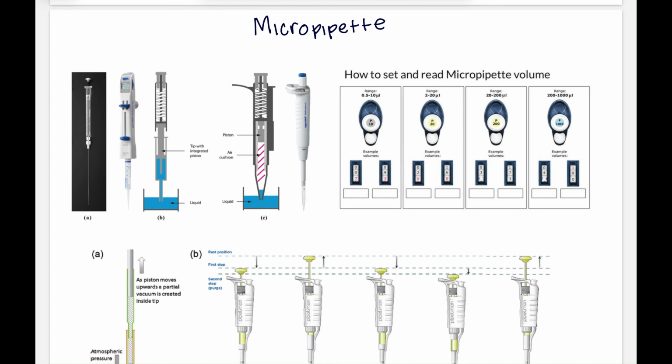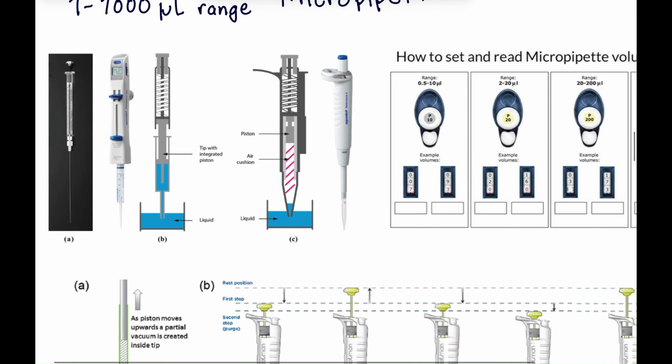If pipettes handle the 0.1 to 25 milliliter range, micropipettes handle everything smaller than that. So that's going to be volumes in the 1 to 1,000 microliter range. And in biotech, that microliter range is really where most of the action happens. So things like PCR reactions, dilutions, assays, almost anything that measures these tiny small volumes with high precision. And so getting this right matters enormously.